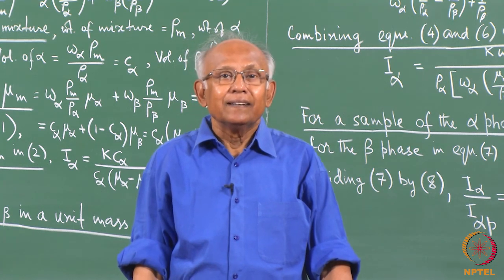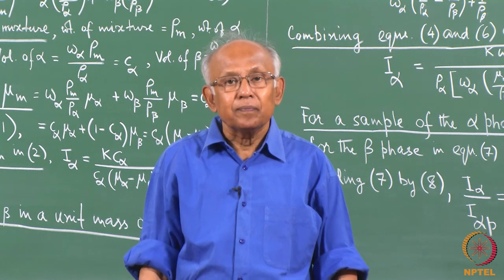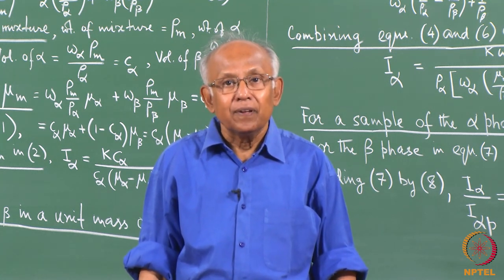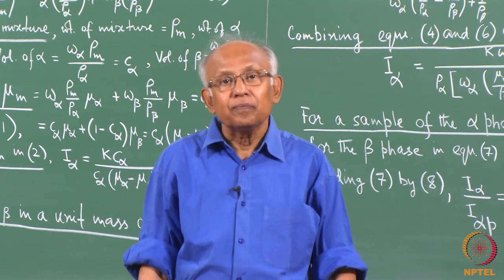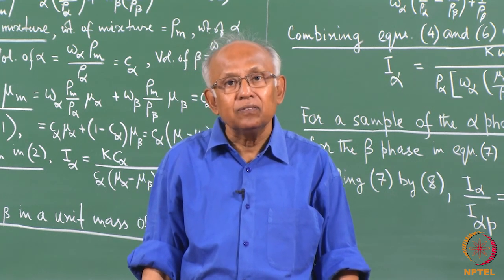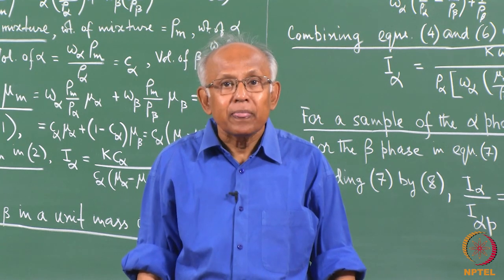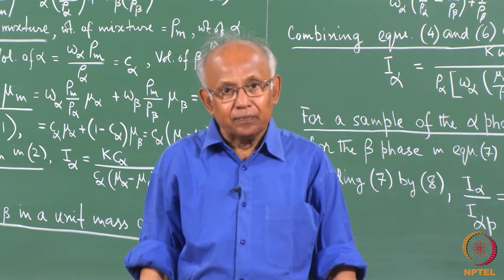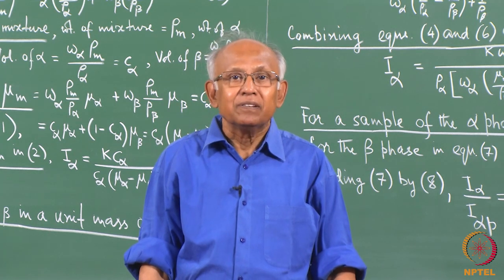Thus, the X-ray diffraction pattern of a phase is very much characteristic of that phase alone. In a sense, an X-ray diffraction pattern of a substance or a phase is just like the fingerprint of a human being, just as by distinguishing between the fingerprints, two persons can be distinguished.